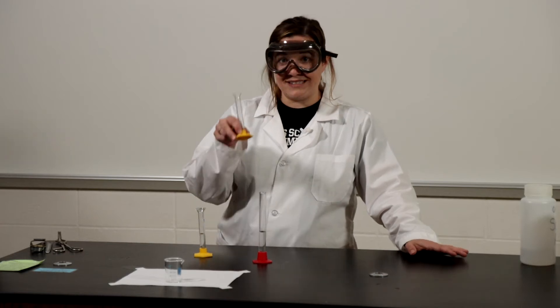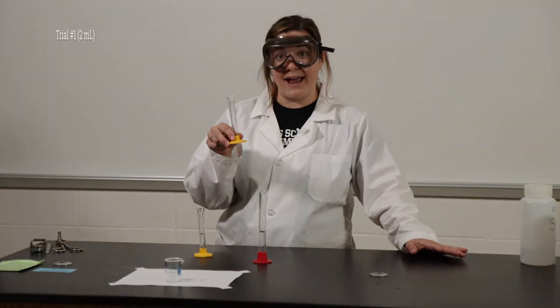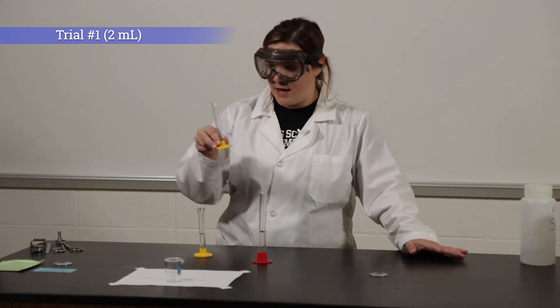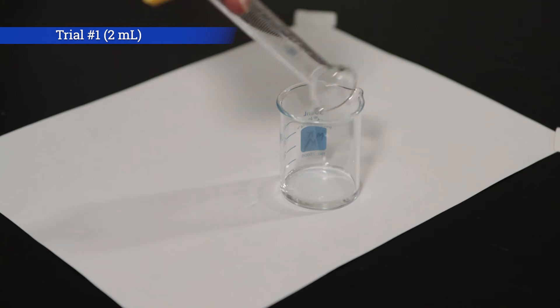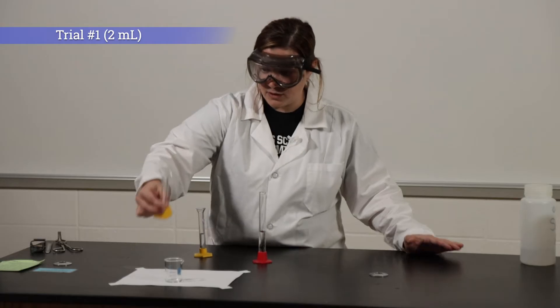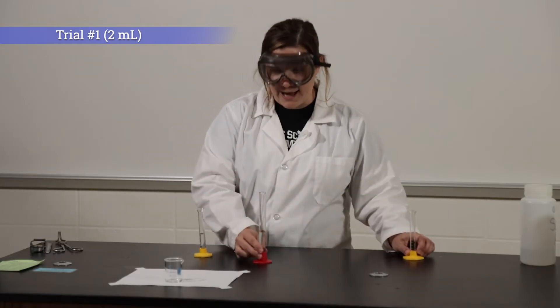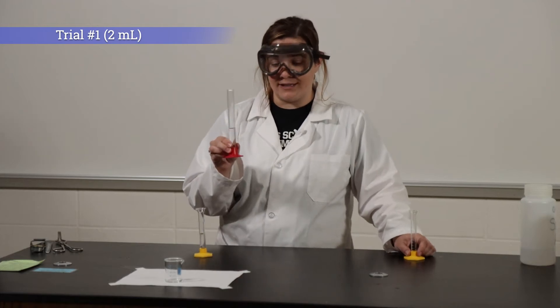So in this graduated cylinder for trial number one I have two milliliters of potassium iodate and I'm going to add that to my beaker. To dilute it I'm going to add 14 milliliters of water.